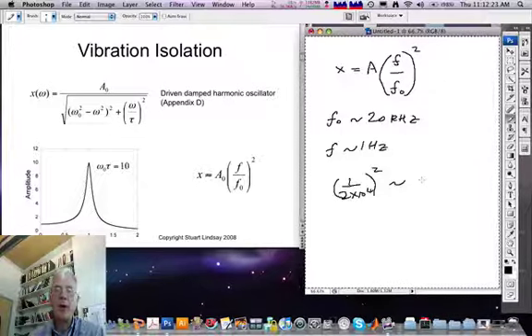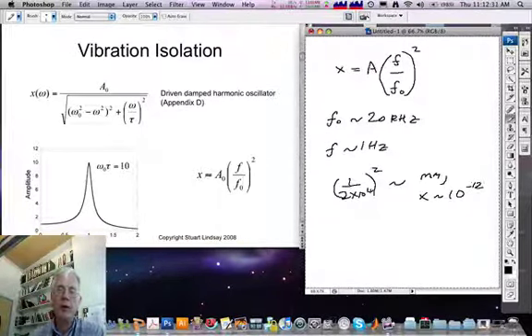That means that if the vibrational amplitude is even on the order of millimeters, the actual displacement of the probe is on the order of picometers.